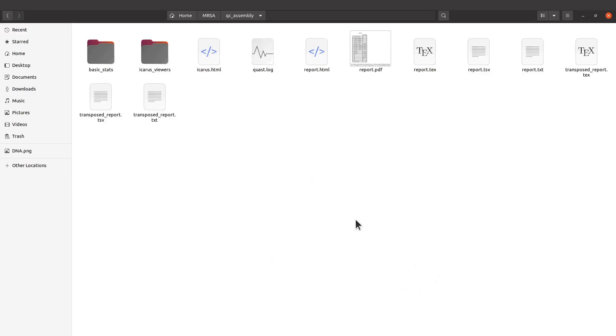Alright, so these are the files we have all of them here. Let's start with the PDF.